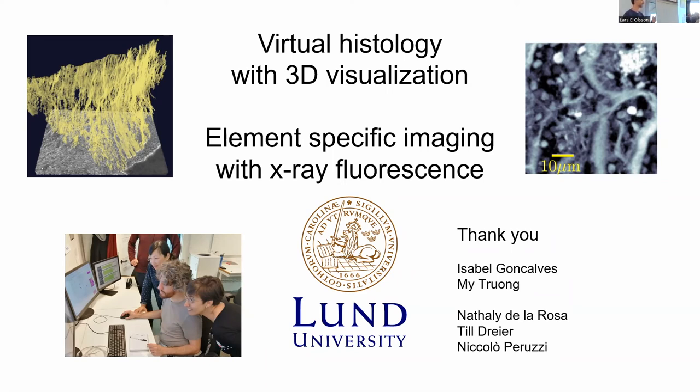Yeah, because Martin and I have been working with lung together. And I think when you're working on branching structures like the lung, which is difficult to understand from a 2D section, the field of view that you get through the synchrotron, we can get really high resolution in a cube that's 3.5 millimeters. So you can follow vessels over some distance and you can see details even in vascular walls in this cube, and then you can section, and then you can do in situ hybridization or stainings and integrate it into the analysis.